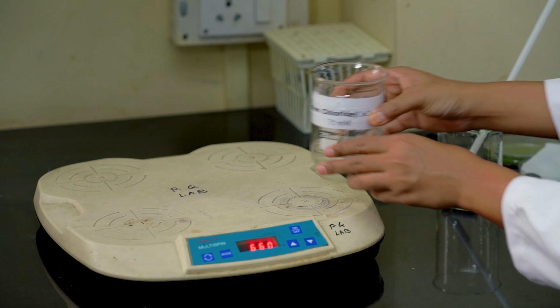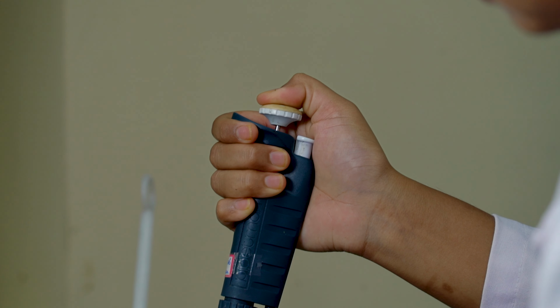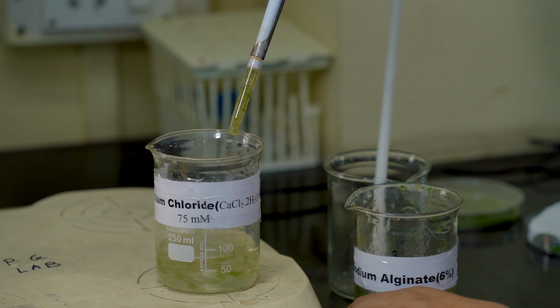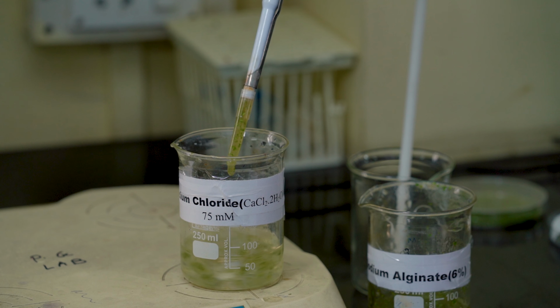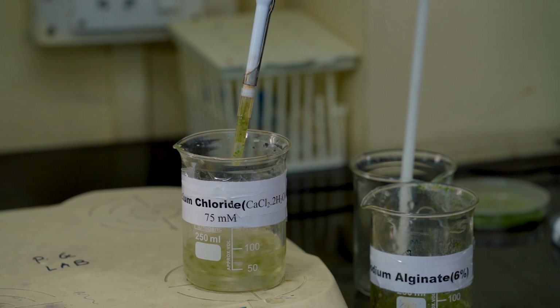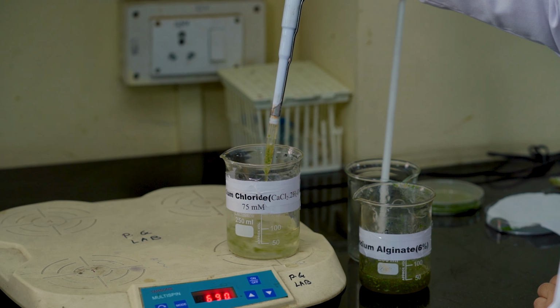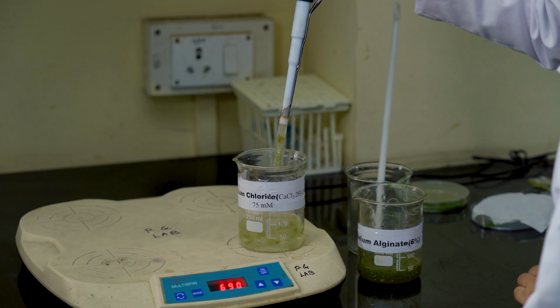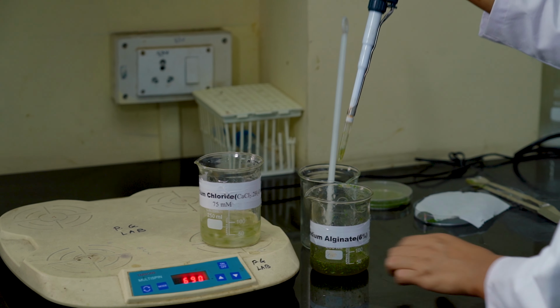Put the calcium chloride beaker on the magnetic stirrer. Hold the pipette perpendicularly. Draw the slurry along with the explant into the dropping pipette. Take care to exclude air bubbles. Now hold the pipette perpendicular to the surface of the liquid medium containing calcium chloride solution. Then release the dropper slowly such that the alginate slurry comes out as a drop with the explant entrapped inside. Here, care should be taken to include only one explant inside one drop.